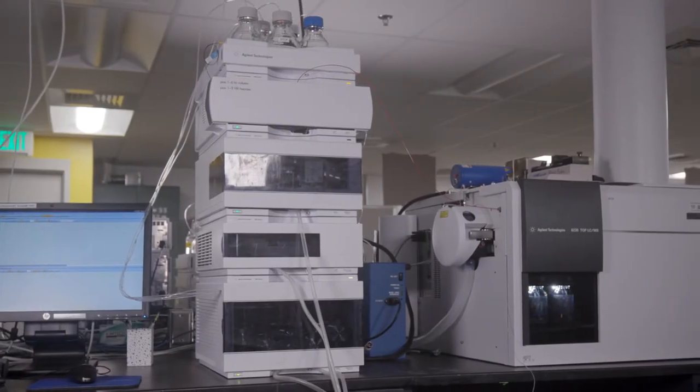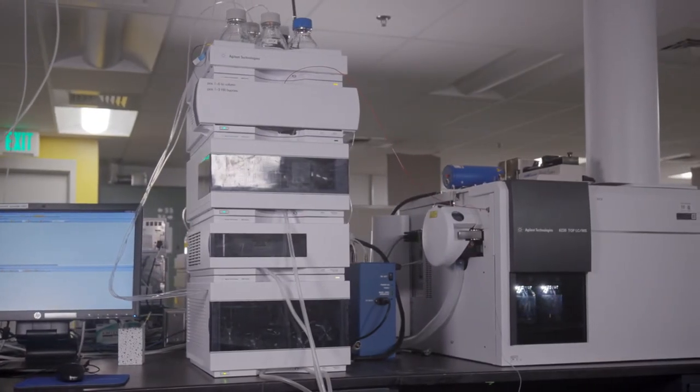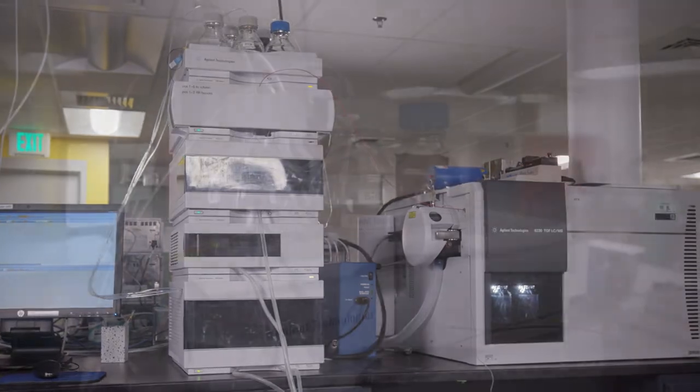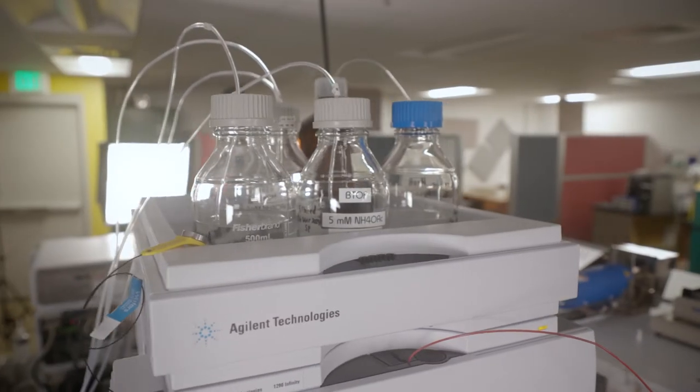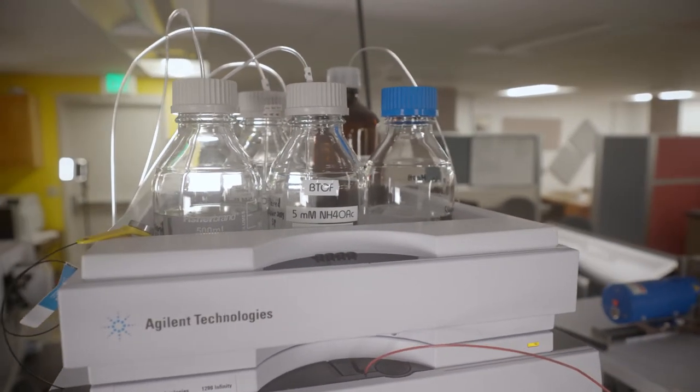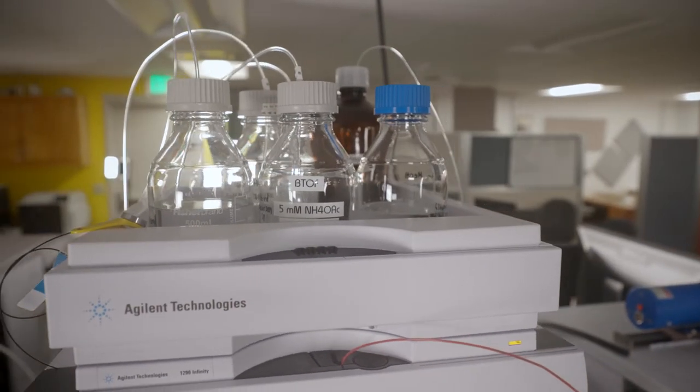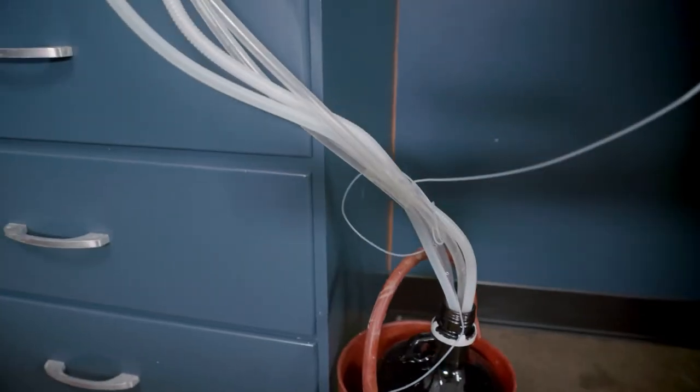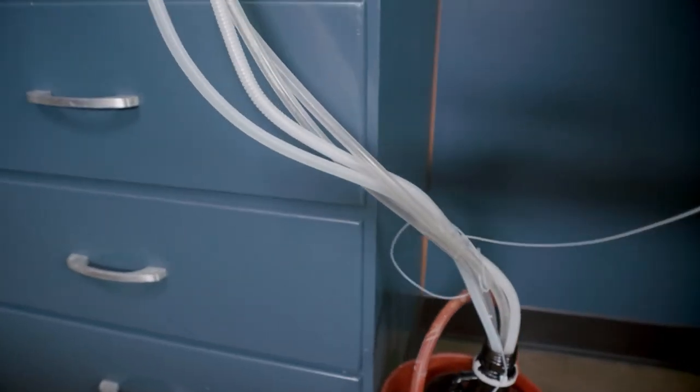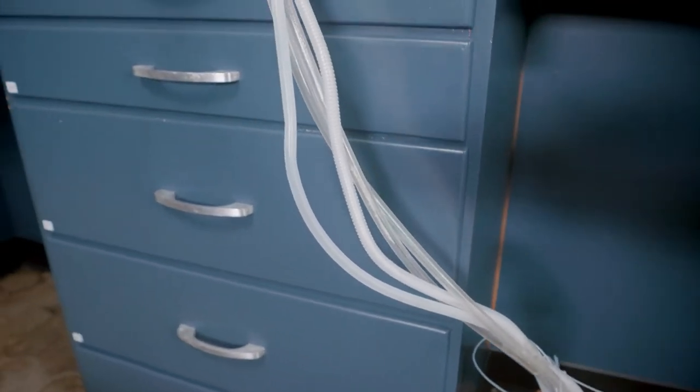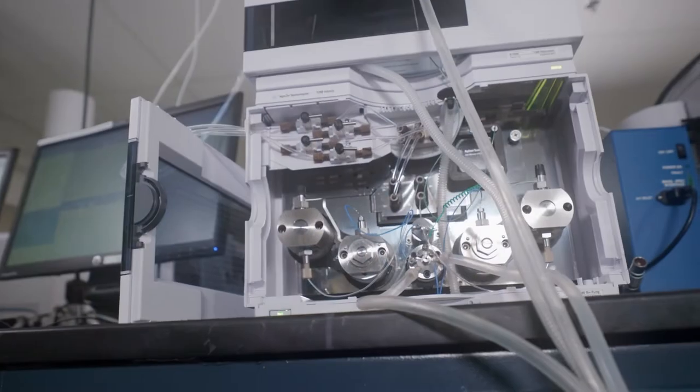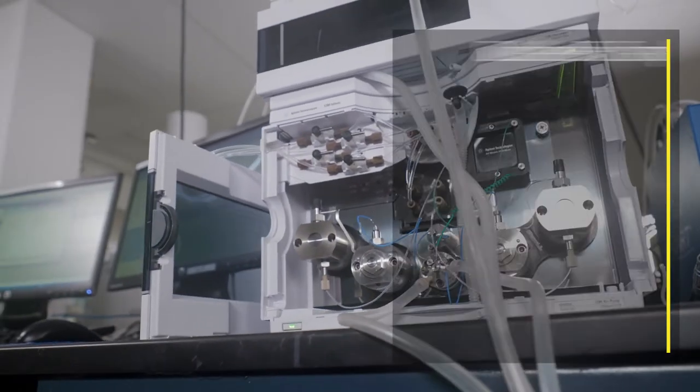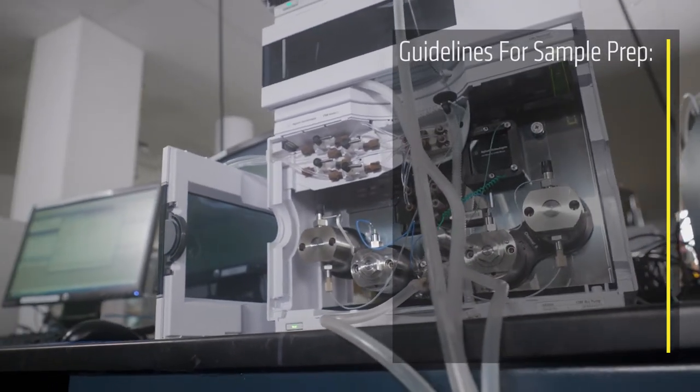Mass spectrometers are sensitive instruments capable of detecting minute, heavily diluted quantities. A sample that is too concentrated or contaminated runs the risk of clogging tubing or causing excessive buildup and wear on the ion transfer capillary.